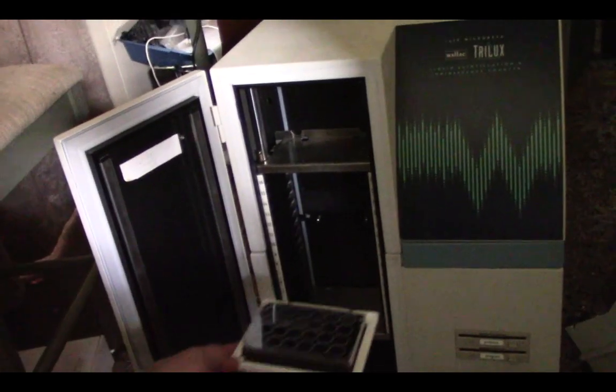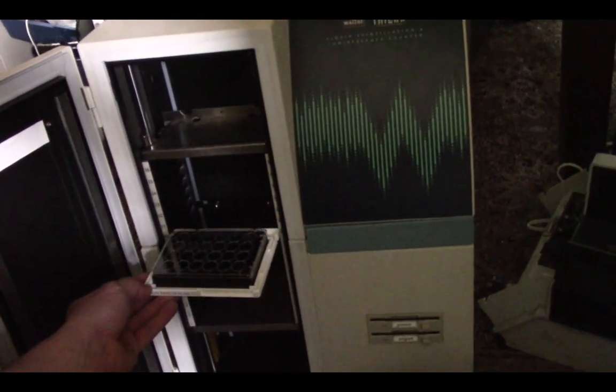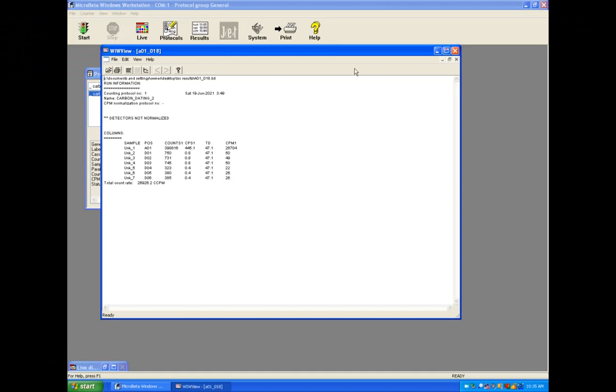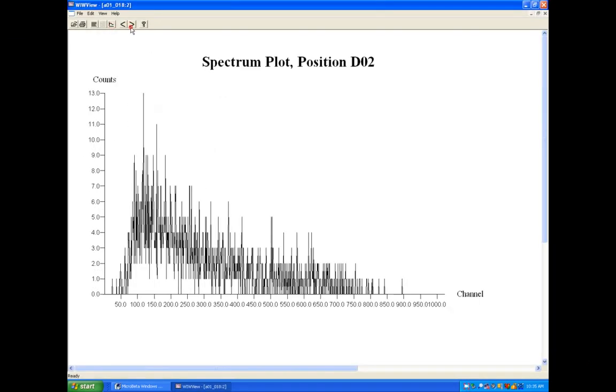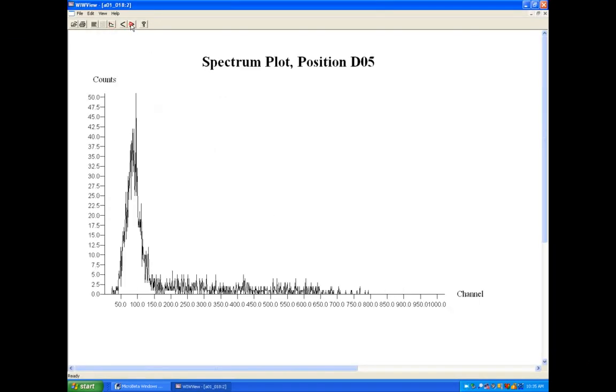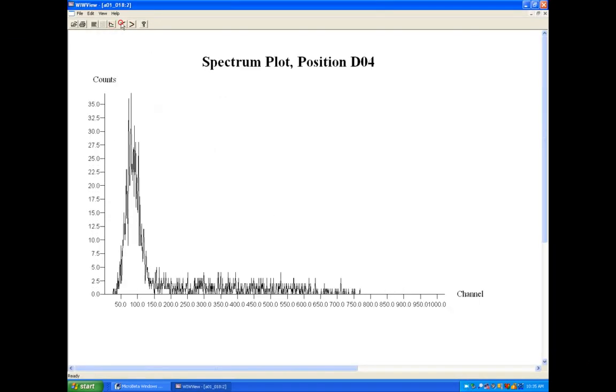Unlike last time I tried to detect it using a different method. For the inner working of the liquid scintillation counter, check out my carbon dating video.